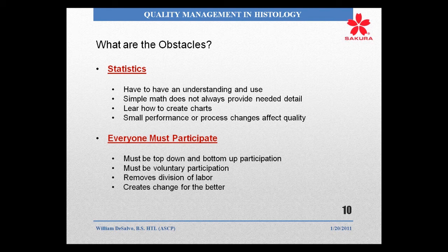Statistics. I had to learn a lot about statistics, and you will have to. You have to have an understanding; you've got to be able to use them. Means, modes, Pareto charts, histograms, everything else, but you have to understand just exactly what you're looking at. Averages just don't do it for you anymore. Simple math just won't work. You have to learn how to create charts. Small performance and process changes can affect quality quickly and much more greatly than you might expect.